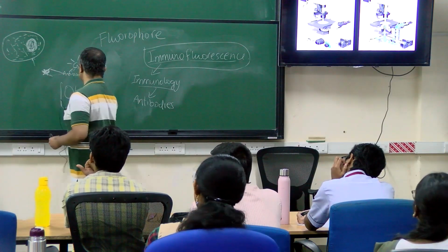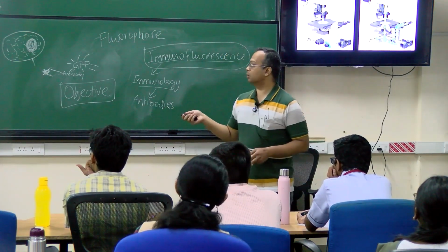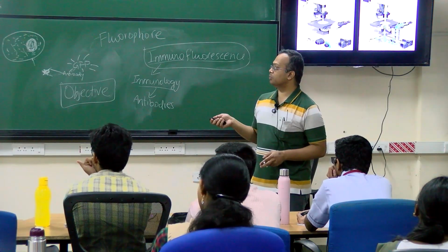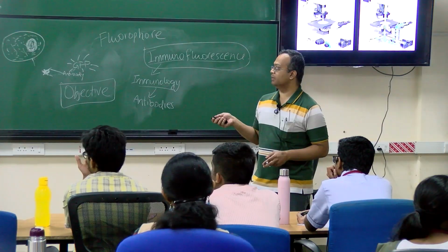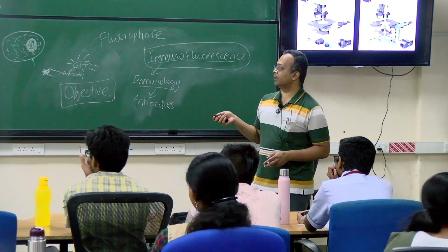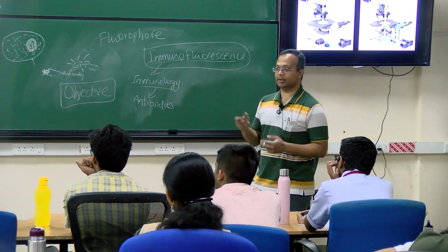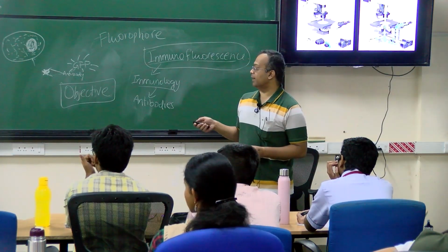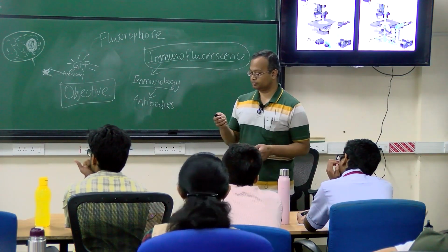This objective is the most important thing in the microscope because it has all the convex lenses inside it. This is the heart of the microscope. Light from your sample passes through the objective, which magnifies it, and then sends it either to your eye or to the camera attached to the microscope, so you can take a picture. This kind of diagram is called the light path inside the microscope.